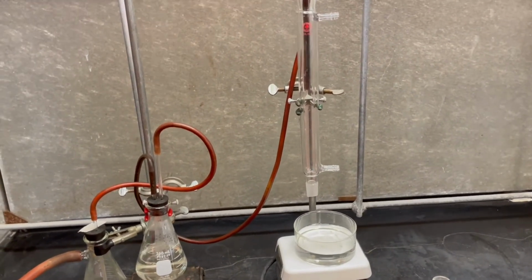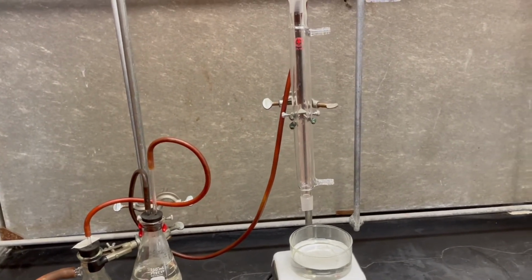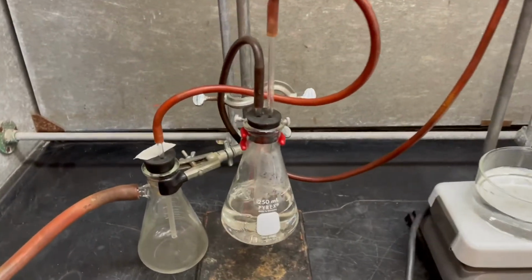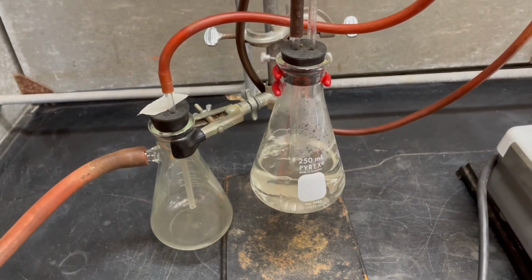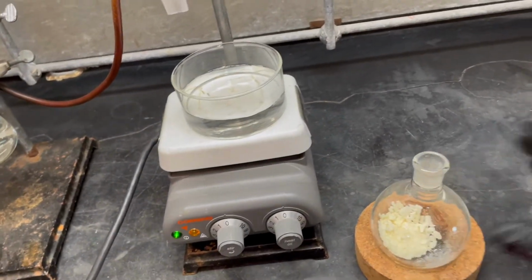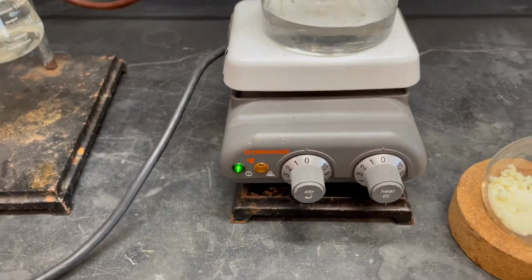We still have nitric acid, and then we throw in some sodium hydroxide. That's not cool, right? Because acid and base directly reacting, it would be a little cray-cray. So what we want to do is make sure that we have those bubbles going the whole time, okay? That's it. So I'm gonna go ahead and connect this. Or actually, sorry, I gotta add my 25 mils of nitric acid, and then I'll go ahead and connect it, and then we'll be setting that water bath on.